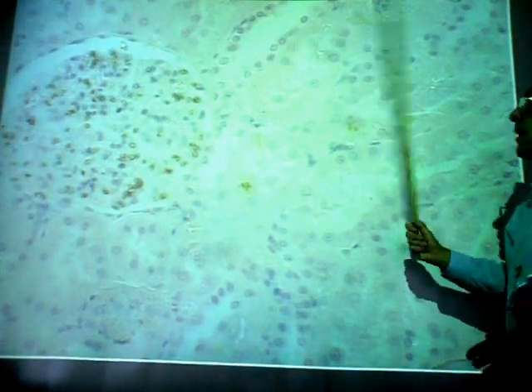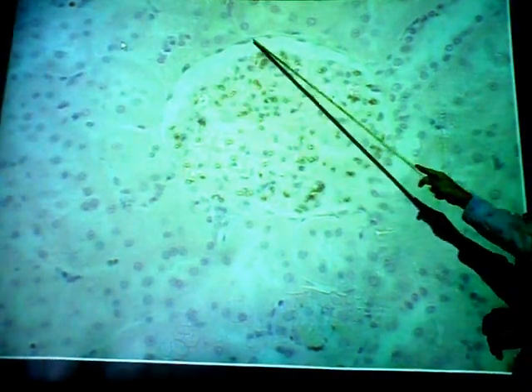Now, most of the renal tubule, the wall consists of simple cuboidal epithelium. But there are some exceptions, and one is right here. The wall of the Bowman's capsule, the glomerular capsule, is not simple cuboidal, but instead it's what? Simple squamous. See the single layer of flattened nuclei here? So that's an exception. Also, the so-called thin segments of the loop of Henle. And on those models you see some parts are very thin and some are thicker. The thicker ones are simple cuboidal again. The thin segments of the loops of Henle are also simple squamous.